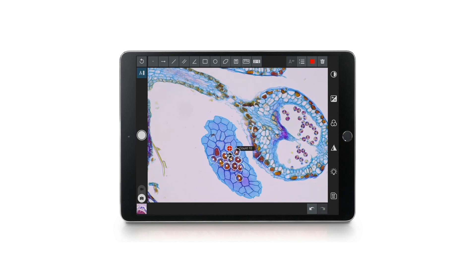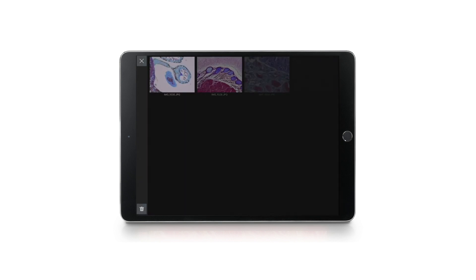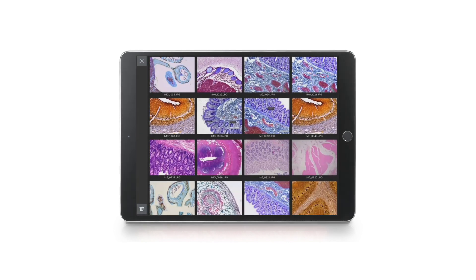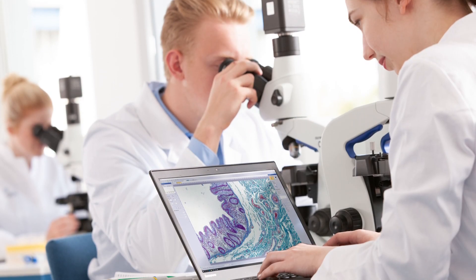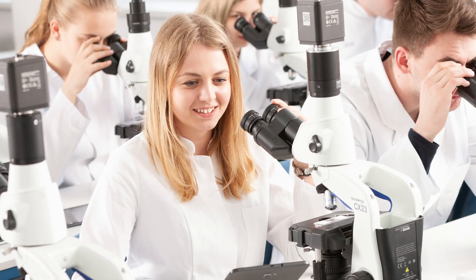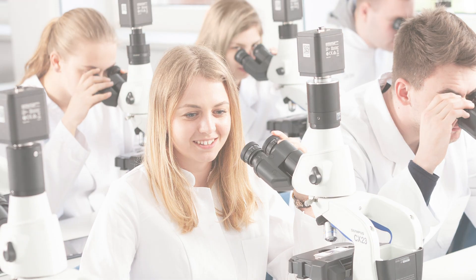When the EP50 is allowed to access the image folders, all captured images are displayed in a gallery. Olympus EP50 digital camera for engaging education in microscopy.